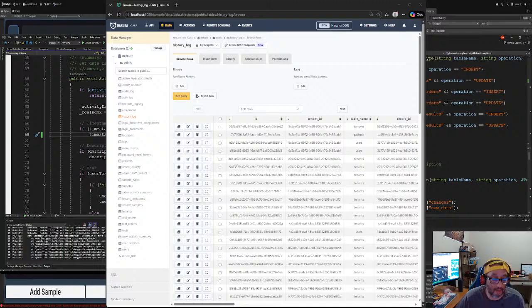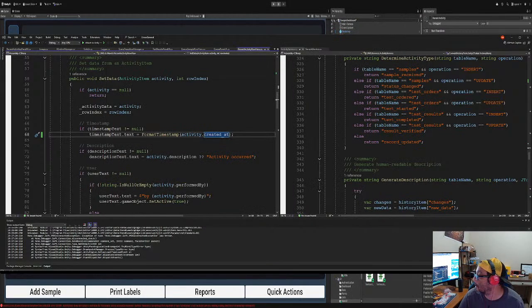So right now it's loading up. You can't see it because of my screen, but it's loading up. Oh wait, I'm sorry for that. You guys didn't see. There we go. Come on, load up. All right, so now we should see the time on the column.